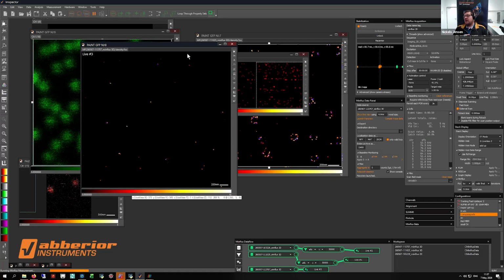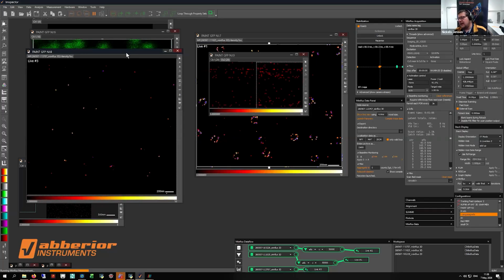That's why we have a lot more iterations. So iterations means always this moving step, in 3D more than in 2D. And for this, we use a DM, a deformable mirror that allows us very fast scanning in Z, just additionally. And the scanners, the EODs, are about 100 times faster than the Galvo, at least the positioning of them.